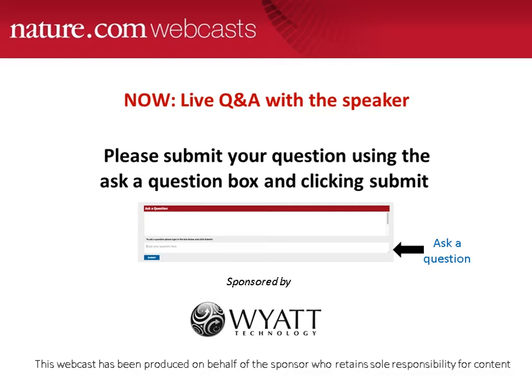Great, thanks, Eva. And our next question asks, can you measure small peptides in SEC-MALS or large protein assemblies such as virus-like particles? Absolutely, and that's the beauty of it. I have measured peptides, which I didn't show, unfortunately, maybe I should have, down to 1 kilodalton. I think even 800 daltons was the smallest one. The trick is that for such small molecules, the concentration has to be relatively high, because the signal in the static light scattering detector is proportional to the product of molecular weight and concentration. So if the molecular weight goes down, the concentration has to go up for the limit of detection, obviously.